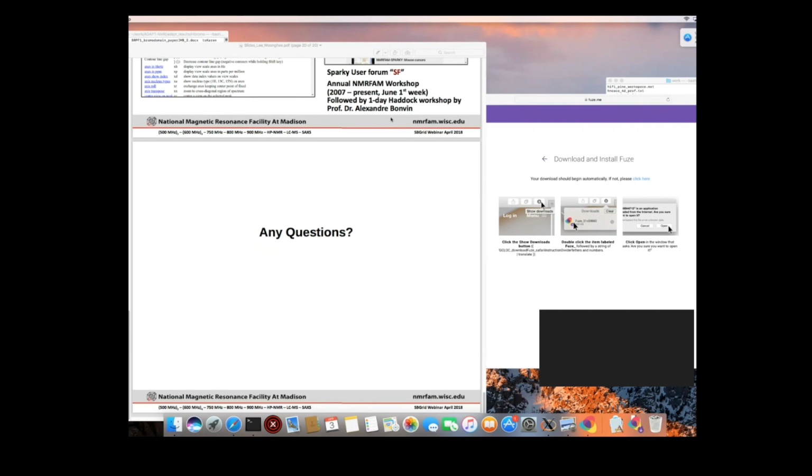So I always recommend, let's say if you pick the peaks in CBCA-CONH, in many cases you don't see the peaks in HNCA-CB if your protein is dynamic. Then if the peaks are pretty robust, I would just copy them over onto this HNCA-CB. That can be easily done by ornament copy and paste, OC and OP. So even though you don't see the peaks in the other experiments, if you see that signal in one experiment, then you should have them in the experiments where you don't see them, because that way iPine can get a more robust and accurate assignment.